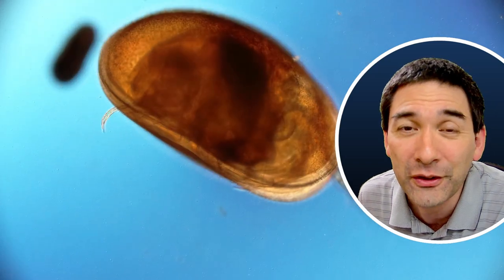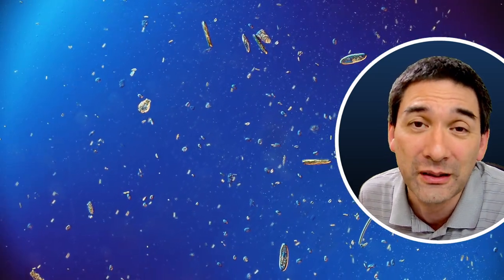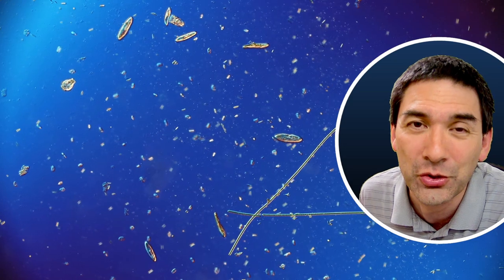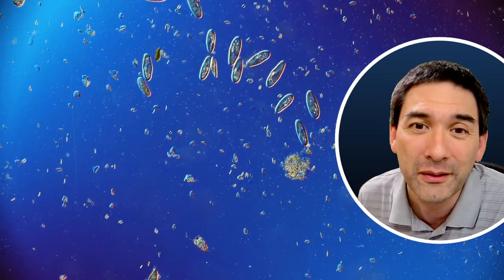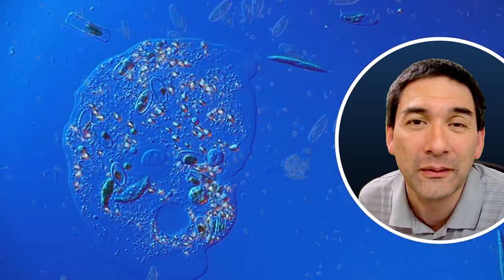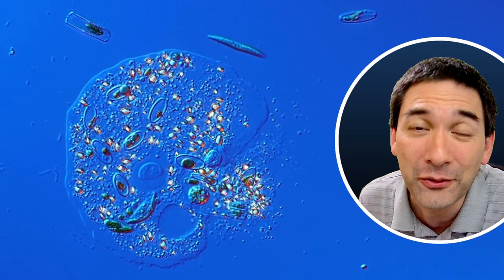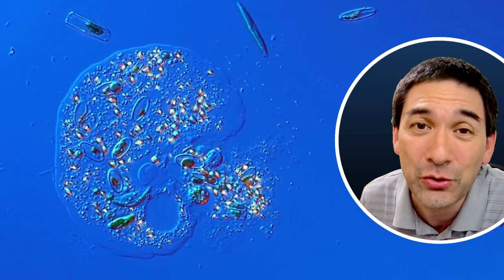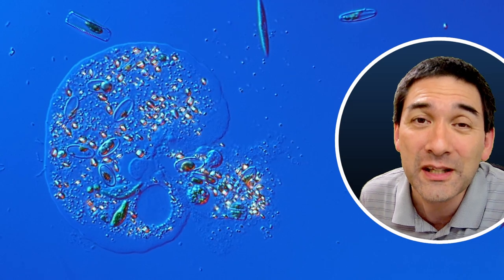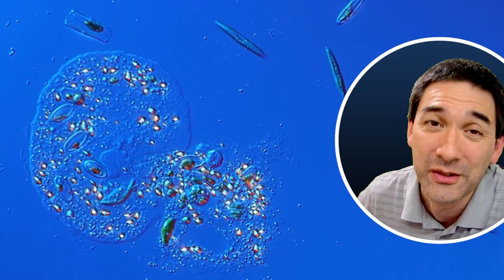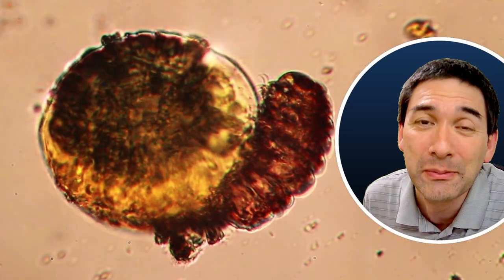Which I also found in the forest. And I also did a little bit of experimentation with some paramecia where I also added some salt water. You can see that here as well, they start to shrivel and shrink because they're losing too much water. Here they're still moving around happily, but over the next couple of minutes they started to lose water. An amoeba I found as well in one of my jars. I also made a YouTube short on this, and here this amoeba is also not quite lucky because it was compressed by the microscope slide and the cover glass, kind of losing all of the organs, spilling the organs.